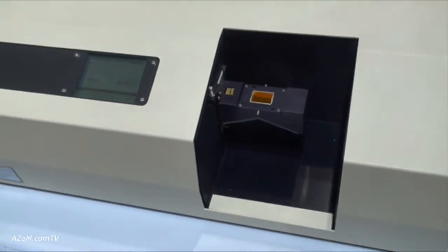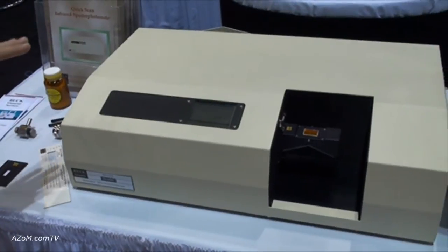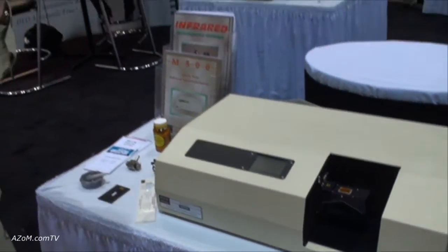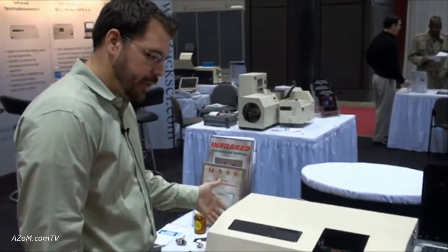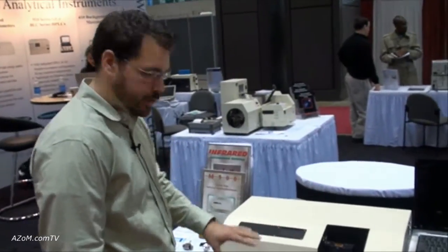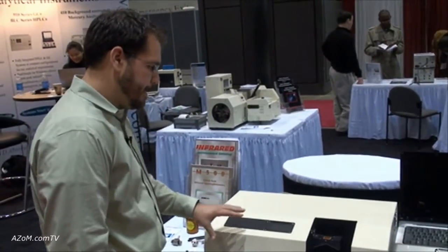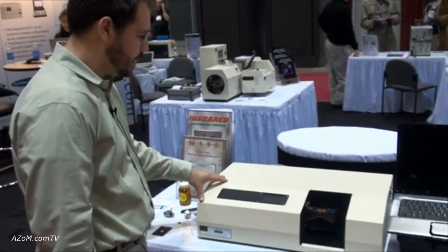So ours is a very rugged instrument. We've had them out in very humid conditions and they still run very well. It's very accessible, so the lid can be opened for ease of showing students how the instrument operates, and it also allows for very easy maintenance and repair should anything need to be done.